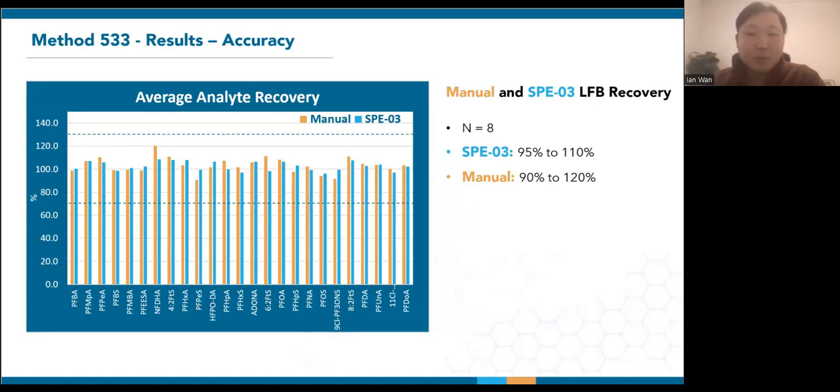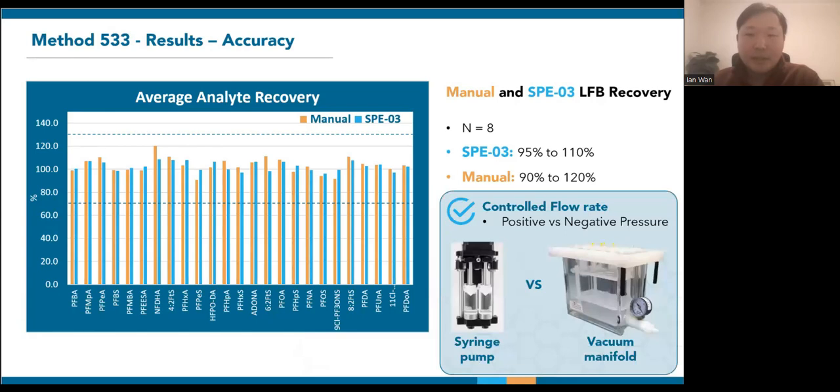Using weak anion exchange in this method works for a wider range of PFAS compounds, but requires slower and meticulous flow control, which is tough when extracting multiple samples simultaneously. To achieve uniform flow rates across all samples, the SPE03 uses positive pressure syringe pumps. Unlike a shared vacuum source, these pumps have individual syringes per channel that achieve accurate flow despite variations in the samples and cartridges. This ensures strict adherence to the extraction protocol and constant extraction times. Using a syringe pump, the liquid only flows with each pump stroke, which also eliminates the concern of sorbent material drying out.